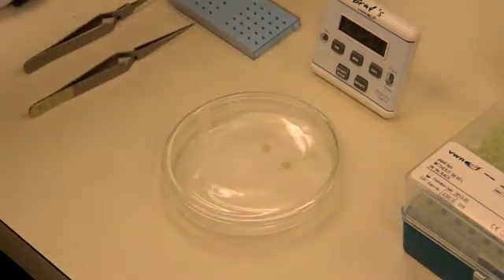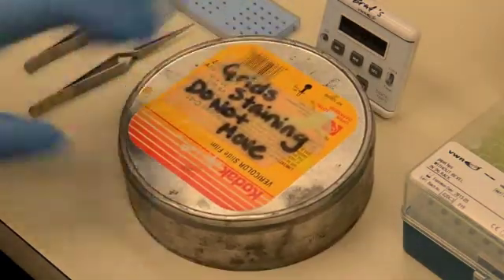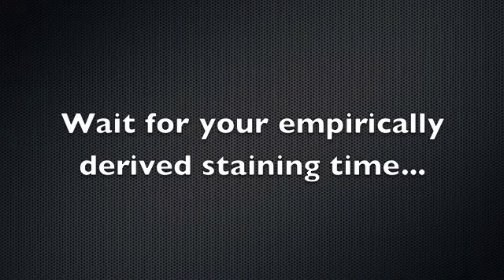Cover the grids with a dark cover and wait for the desired time for staining. This is usually 12 minutes for animal tissue and 20 minutes for plant tissue.